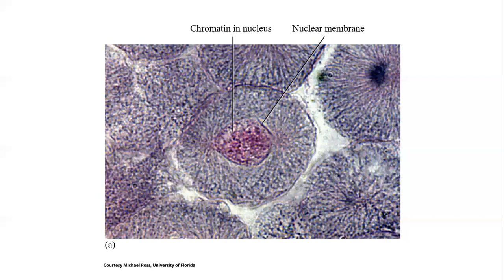So for this portion of the lab, it will be essential to check out the microscope slides that we do have in the lab. They look a good deal different. Magnification will not even be close to this, so it'll be good to train your eyes on those slides. And so if you come on September 11th, Saturday, after the lab, you are welcome to check these cell division stages. We'll have microscope set up for your practice.